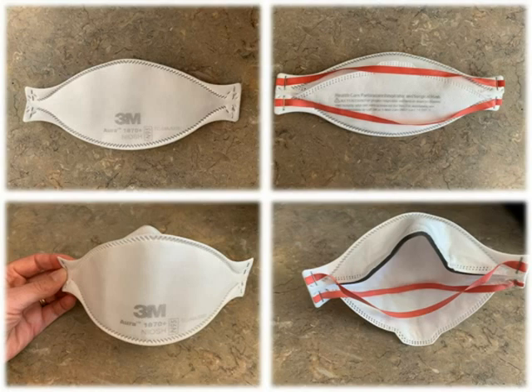The N95 FFR respirator fits tightly over the nose and mouth. This allows all air brought into the wearer's body to be filtered through the mask and have infectious agents trapped before entering the wearer's mouth or nose. The photos on the top show the N95 respirator front and back before it is opened. The bottom shows the mask open and ready to apply.